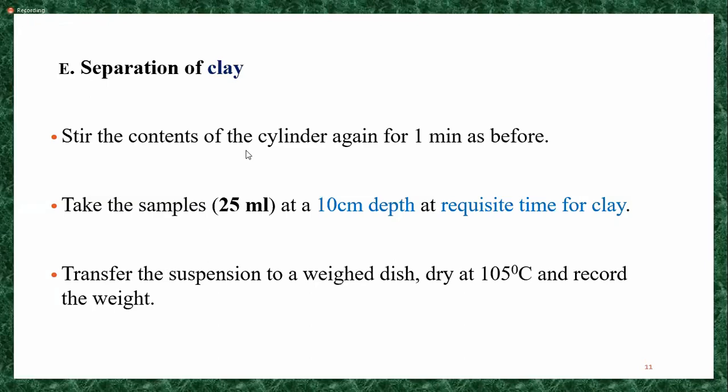You already added more water and already stirred the solution. You have to again stir the contents continuously for 1 minute. After that you have to pipette out around 25 milliliters of sample, taken at the depth of 10 centimeters.